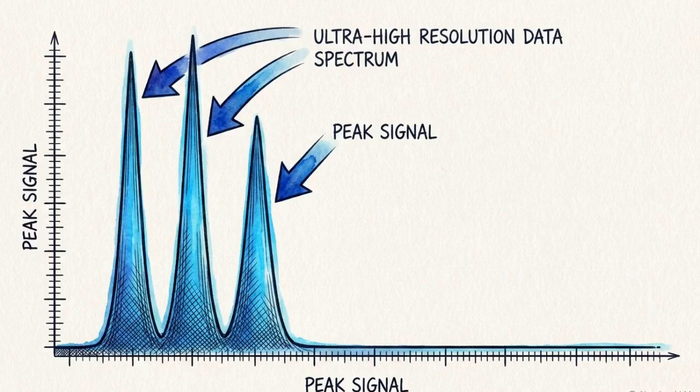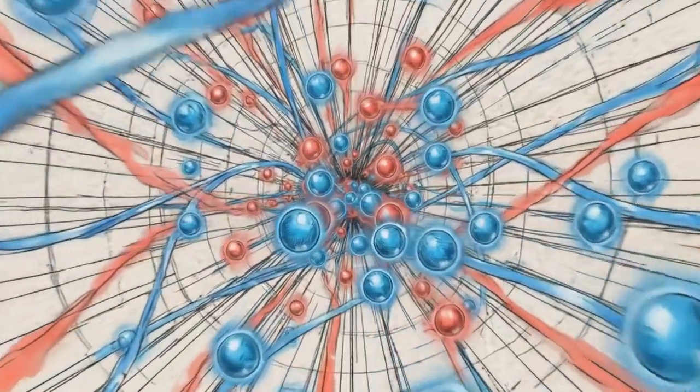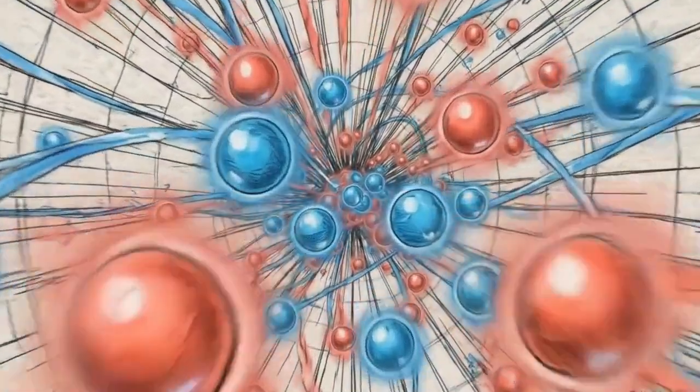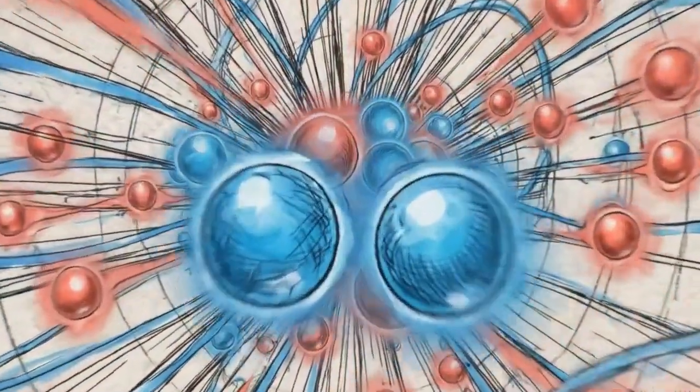The final spectrum, whether it shows a few massive intact peaks or thousands of tiny fragments, is entirely dependent on the physical constraints engineered into the analyzer. Chemical analysis is an exercise in applied physics. Mastering these principles lets scientists engineer physical rules that force the molecular universe to reveal its identity.